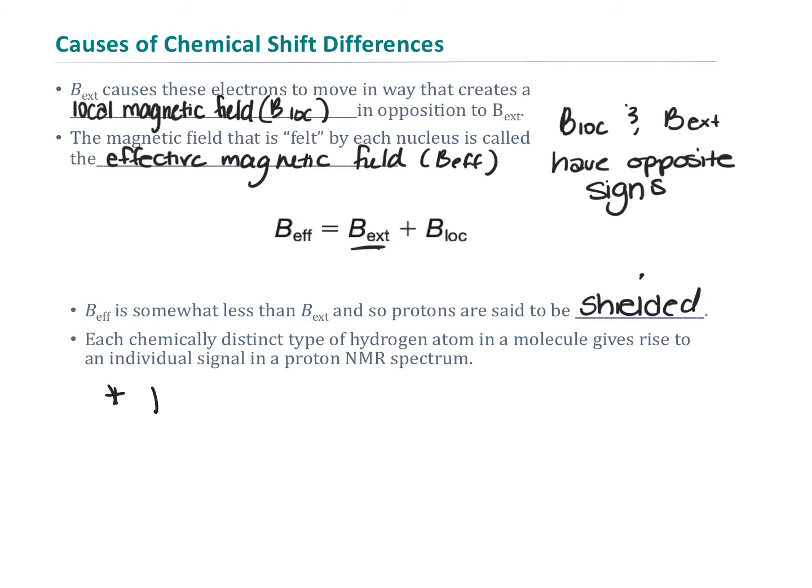So, protons in identical chemical environments, right?